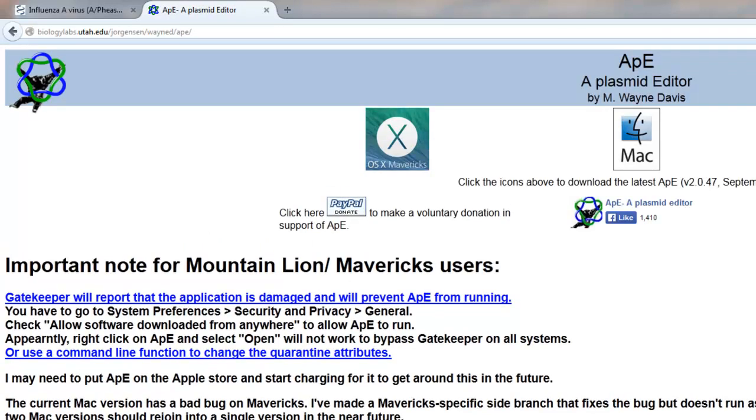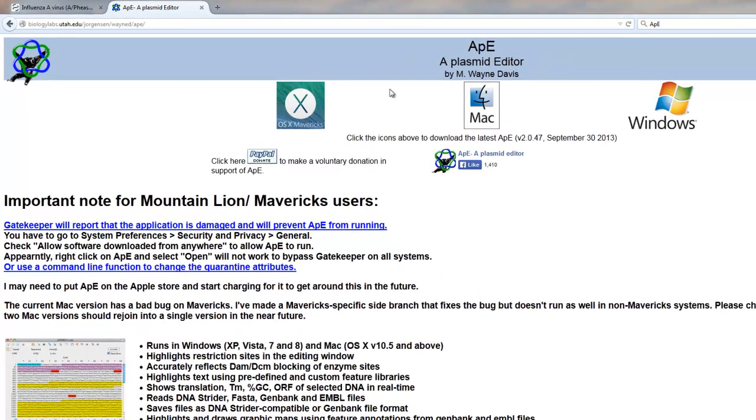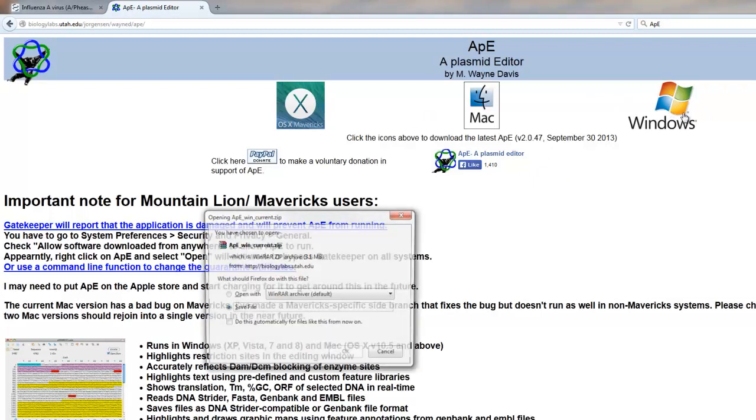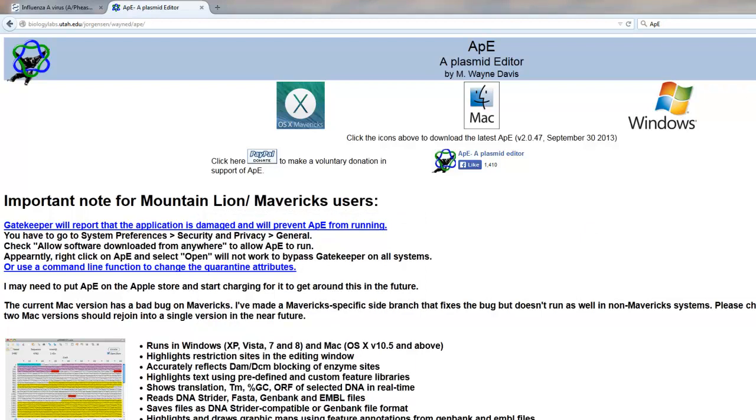I'm going to click on this, and then we're just going to go ahead and click on the icon up here, depending on what operating system you're running. I'm on Windows, so I'm going to click on Windows here, and I'm just going to go ahead and save. Okay, I'm going to wait for it to download, and it's done.